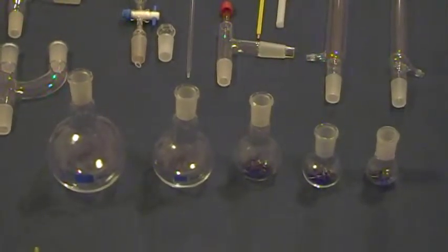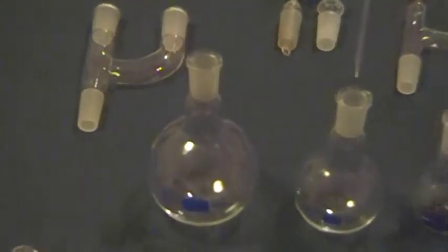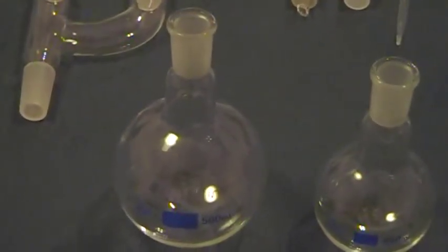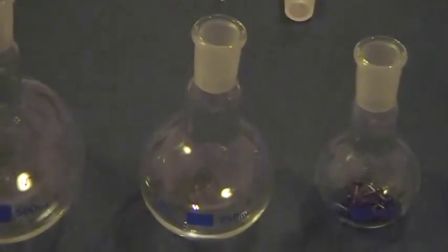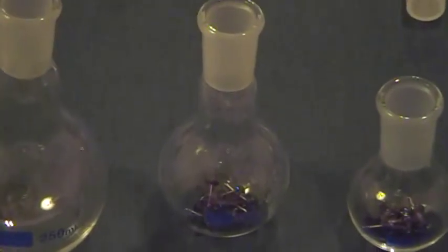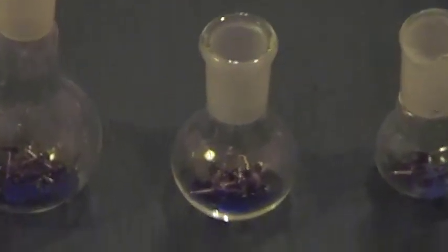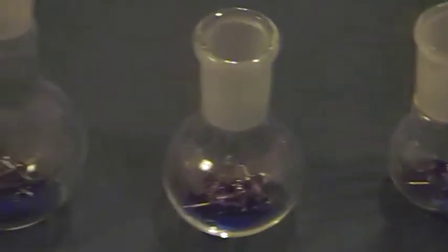The round bottom flasks in this series include a 500mL round bottom flask, a 250mL round bottom flask, a 100mL, a 50mL, and a 25mL round bottom flask.